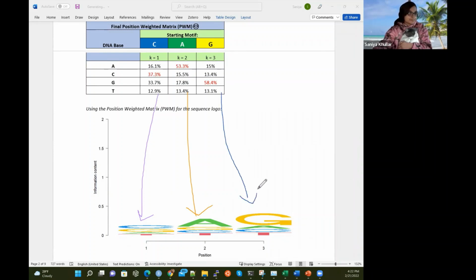maps here. What you'll see is that the base at the top is either the base that has the highest probability or it's tied with another base. That could be the case, and we'll see an example where 2 bases have the same probability. Multiple could have the same. Theoretically, all of these could be 25%. They could all be the same as long as they add up to 100%.